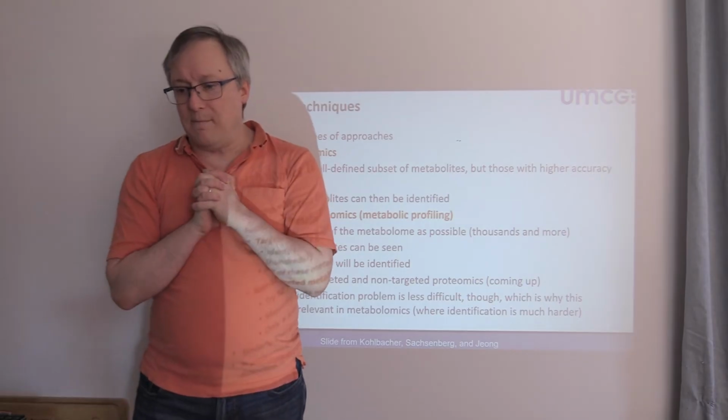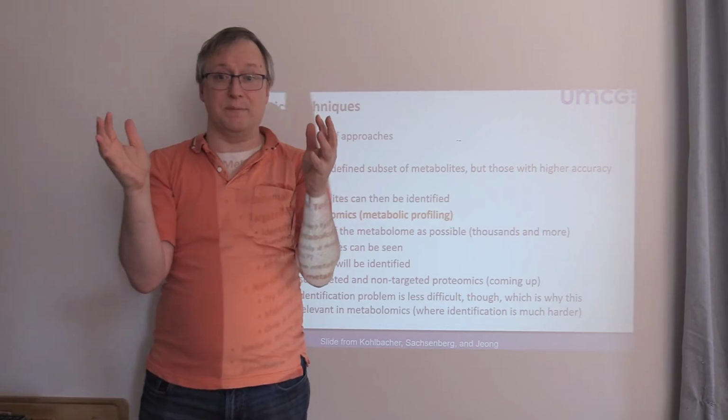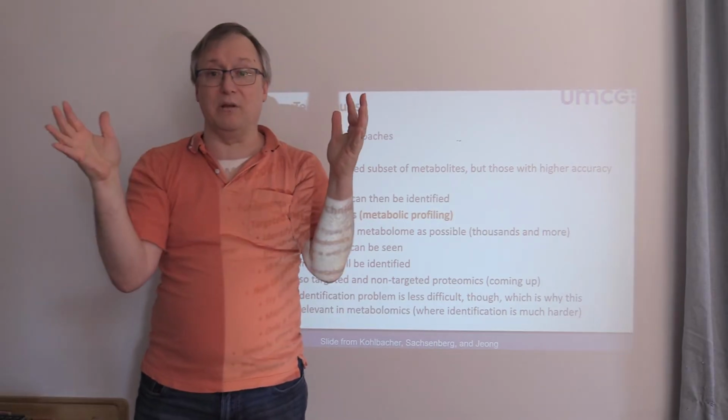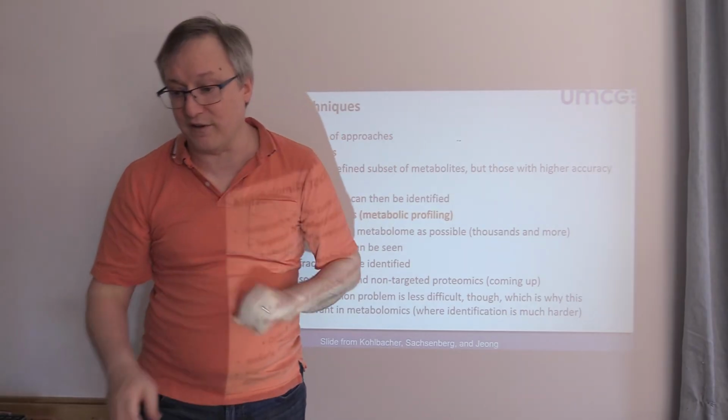Okay, so the untargeted or non-targeted discovery experiment is to say what metabolites are here. The targeted is much more about quantifying some in specific.